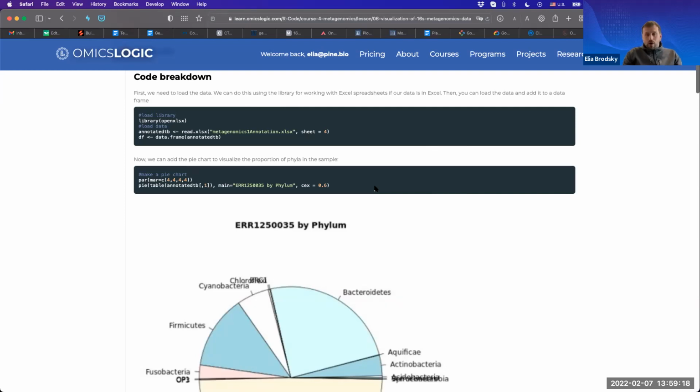If you already know R, you know that for many different applications in R, there's typically a library that already contains many of the functions that you would like to use. So you don't actually have to reinvent the wheel. Some of these packages are very specific, like phyloseq. They just produce a set number of plots that are useful for a particular application, like, for example, phylogenetic analysis for phyloseq. But some of them are more general libraries, and those libraries include ways to visualize data and create different plots, or maybe calculate different statistics for different types of things that you can find.